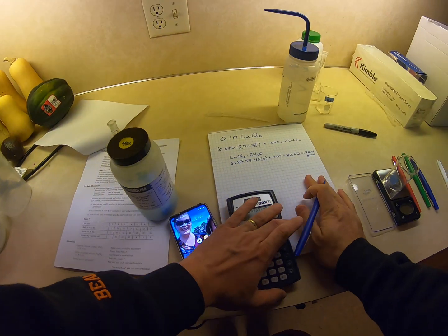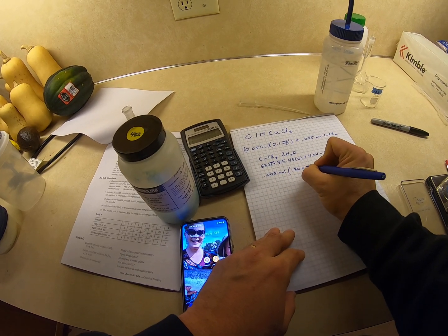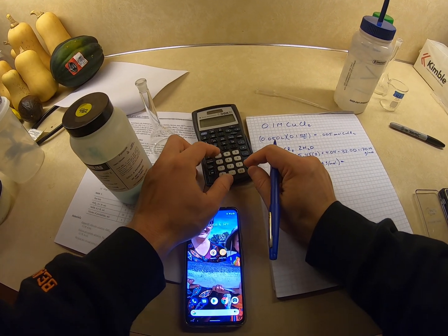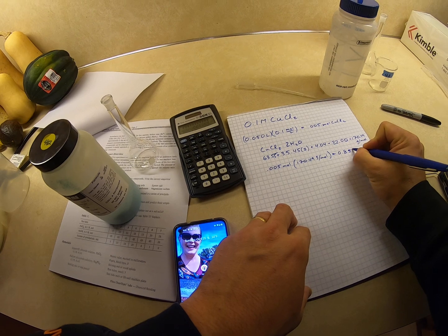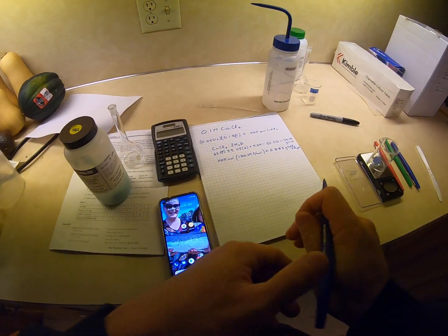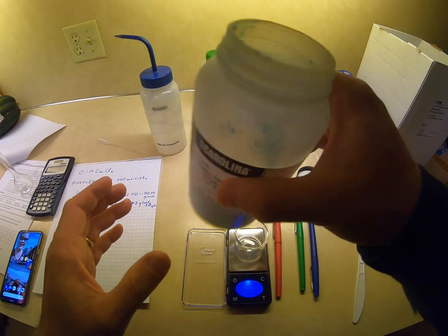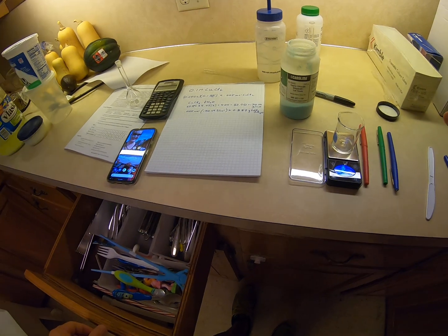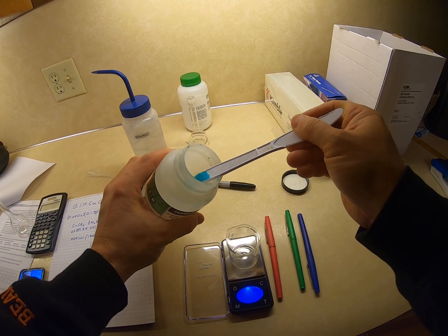grams per mole. So if I need 0.005 moles times 170.49 grams per mole, I need 0.852 grams of CuCl2·2H2O. So I need 0.85 grams. I'm going to zero this out. And I've got my spatula. I'm going for 0.85 grams, which is not very much.